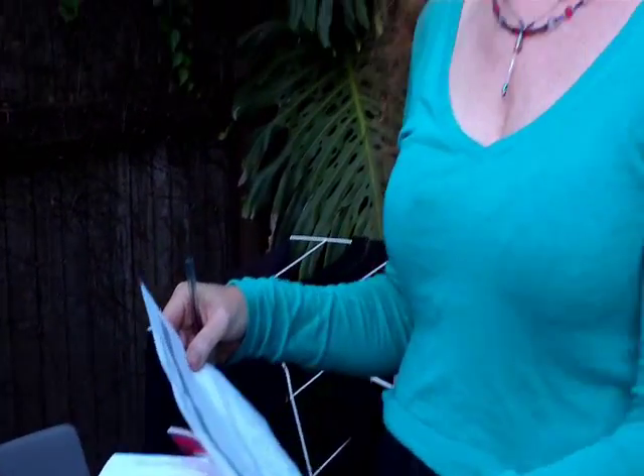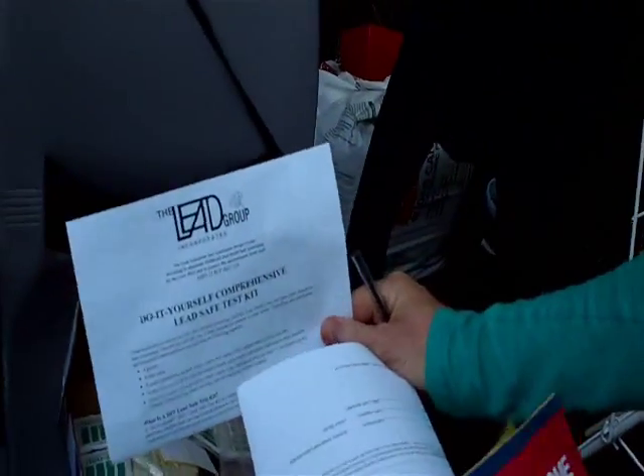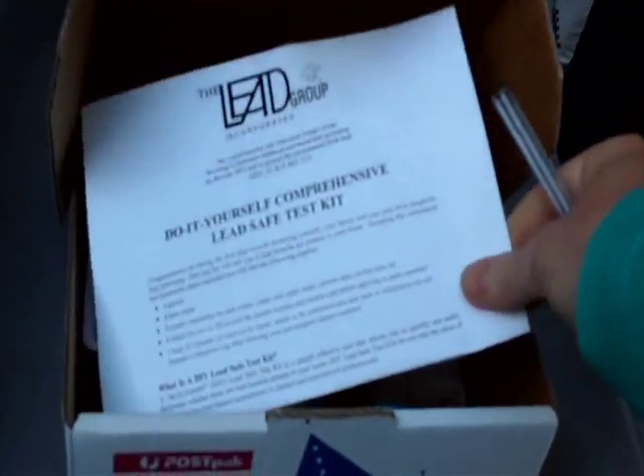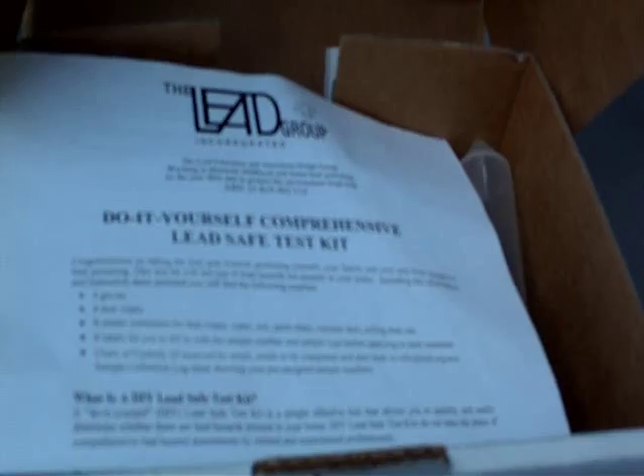The first sample I've asked the residents about is where their child plays, so we're going to take soil samples. We've got the chain of custody printed out from the email so we can see the sample numbers for this particular kit. We've also got the instruction sheet from the box, which tells us to fill in the type of sample on the chain of custody.